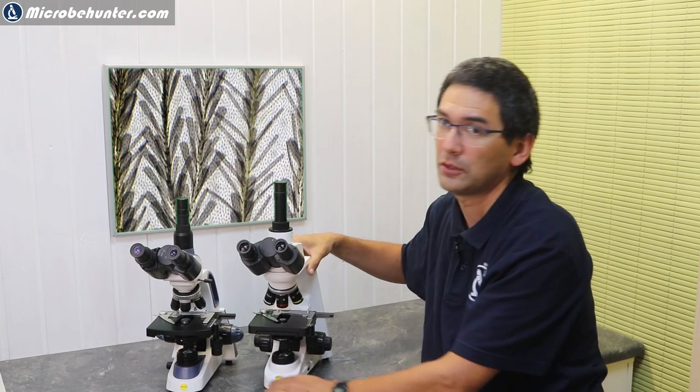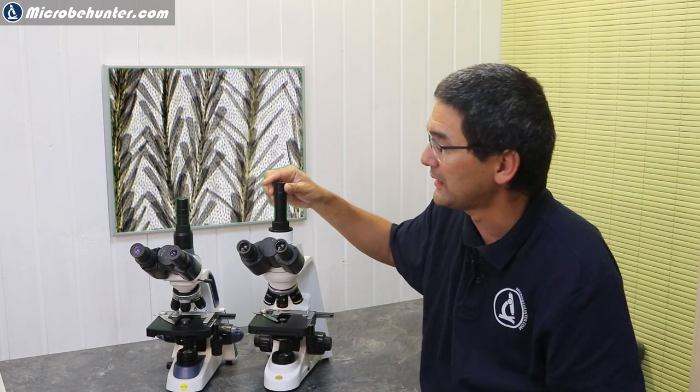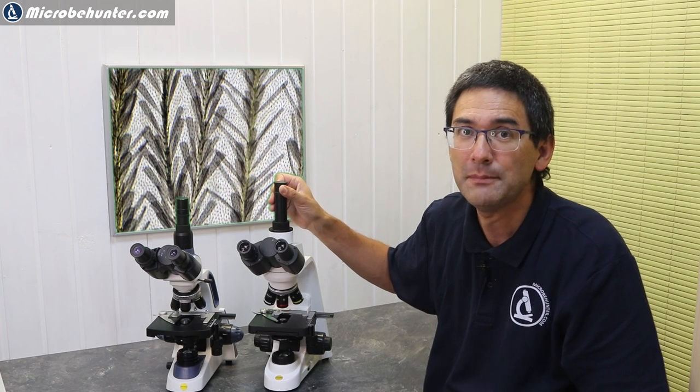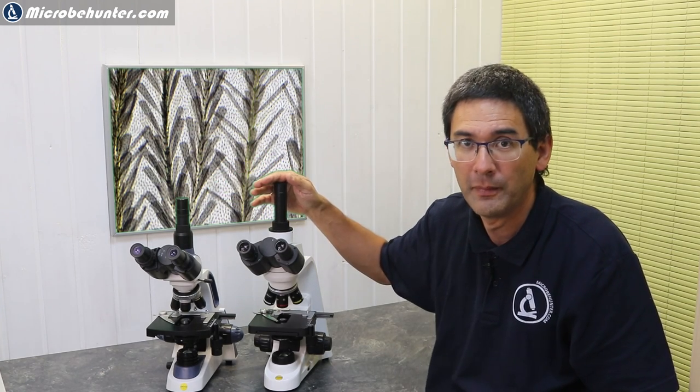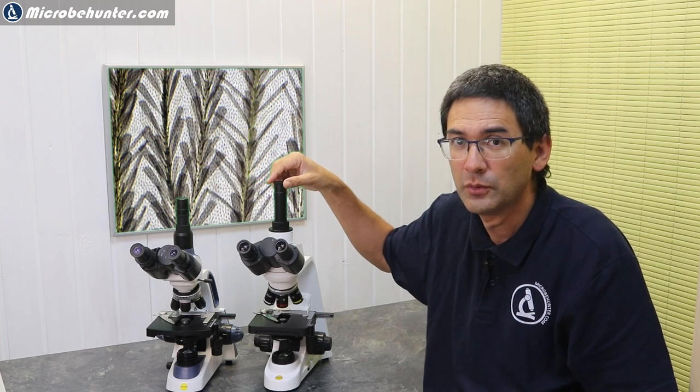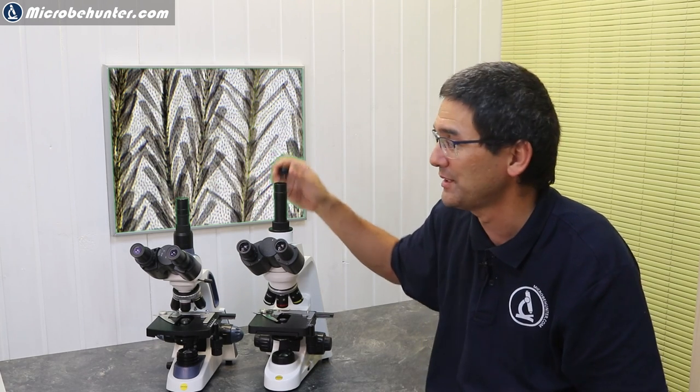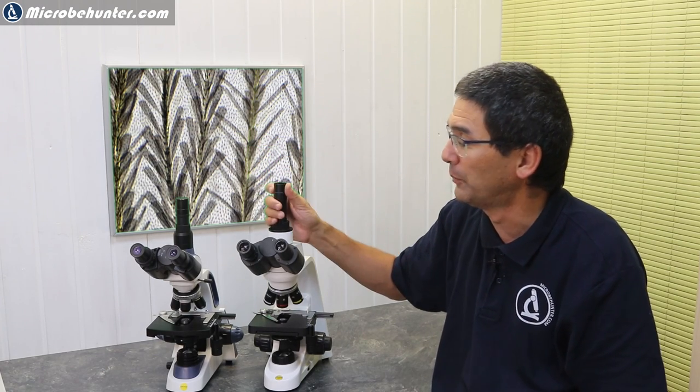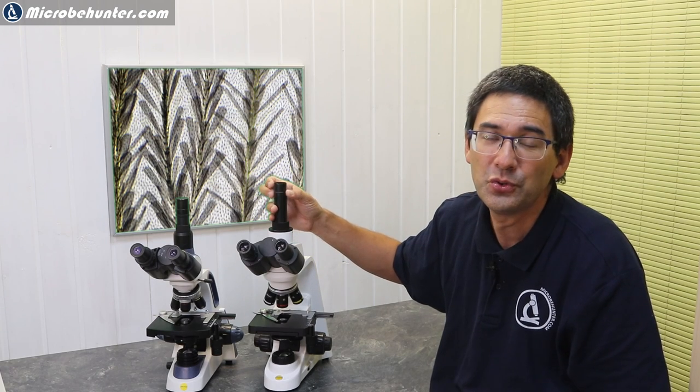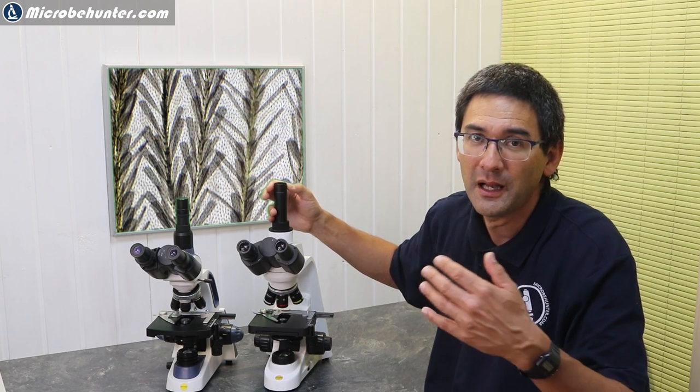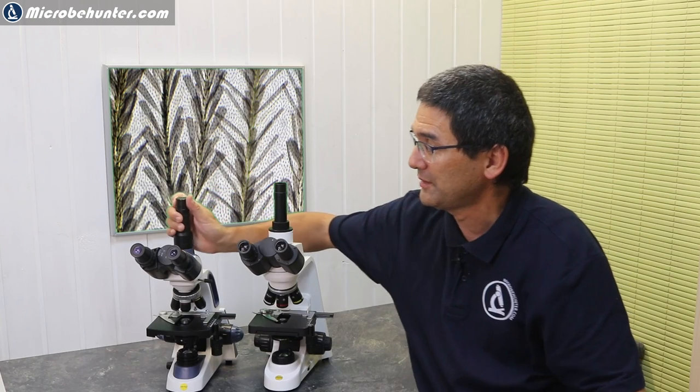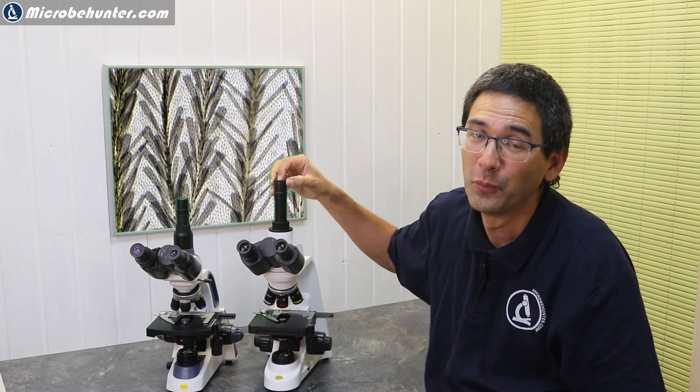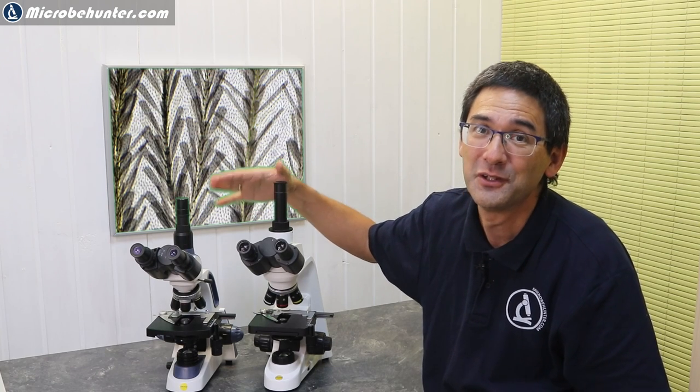I already talked about the photo tube, but there's one thing that I still want to mention here, and that is the possibility to connect a C-mounted camera to both of them. Normally you can of course always connect so-called eyepiece cameras—this is the standard. But here at the top you can also take the top off, and this allows you to connect a C-mounted camera. Both of them allow you to do this. This is something I wanted to mention because not every microscope with a trinocular head gives you this possibility.